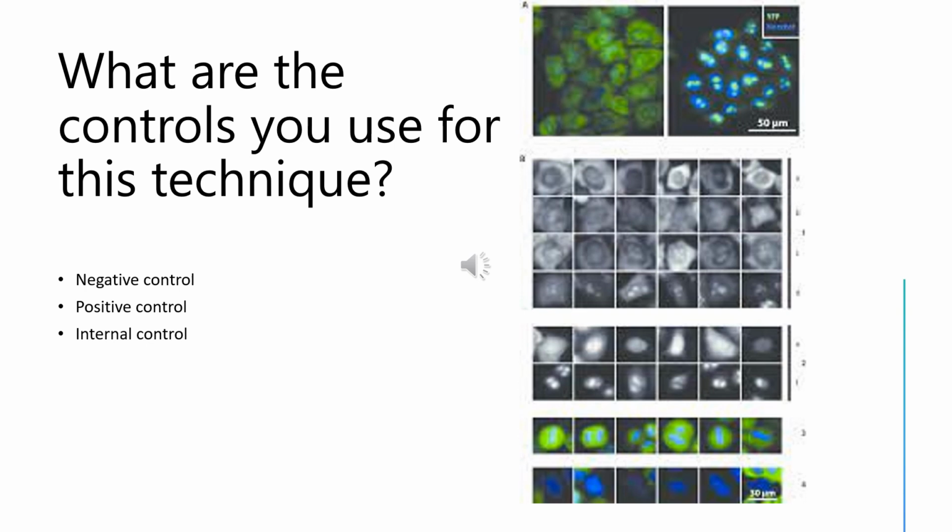And an internal control is also used, and this is meant to be used for reference dyes or beads to ensure consistent imaging settings and quality across different samples. It helps to monitor and correct variations in imaging conditions.